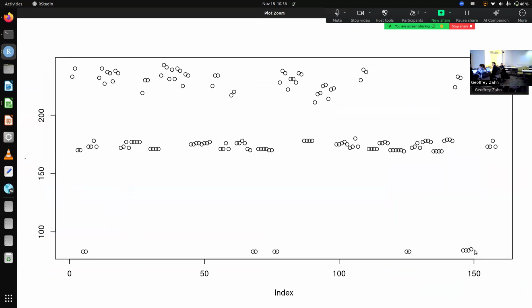Okay, so we're really only throwing out a little bit if we picked 150. For these particular samples that I randomly chose from this study, 100 and 150 would make no difference because there's nothing between there. So we've got some really low reads. Those are going to get tossed out whether I pick a cutoff of 100 or 150. If I pick a cutoff of 200, then I'm throwing out a whole lot of data.